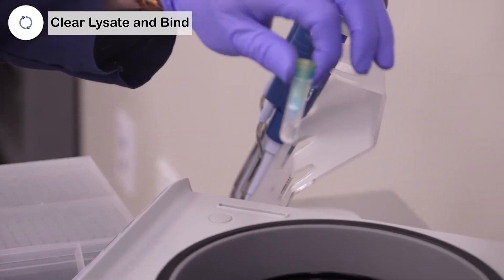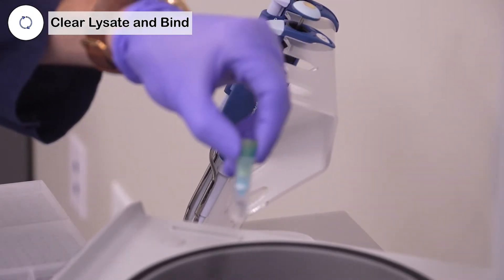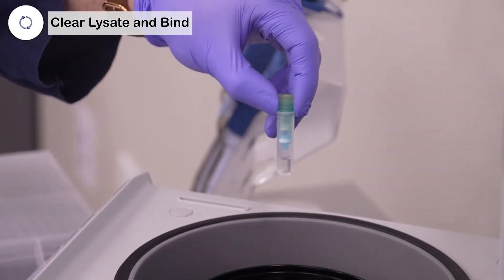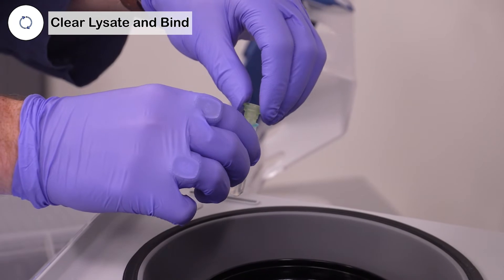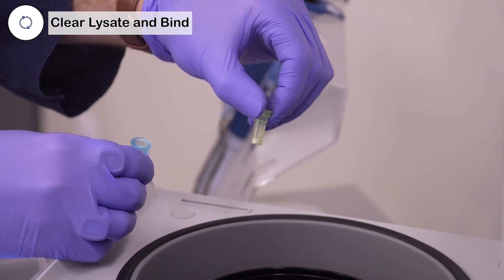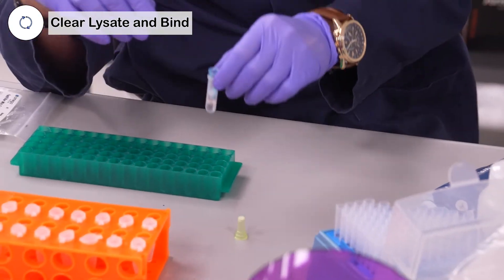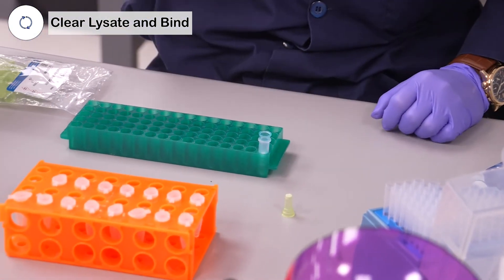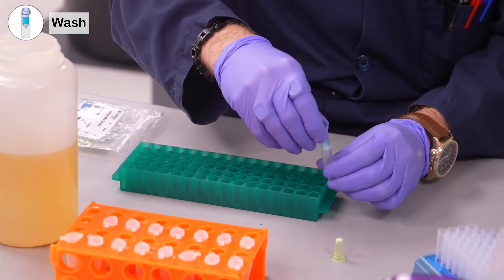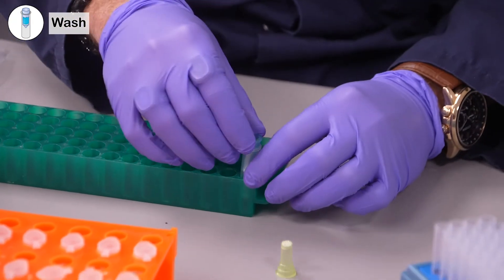When you pull it out, you'll see that you have clear liquid at the bottom, and all of the particulate material will have been captured in the fast filter mini column. This can now be put to the side — we're done with it. You're going to dump the flow-through in the 2 mL collection tube and reinsert the high bind.